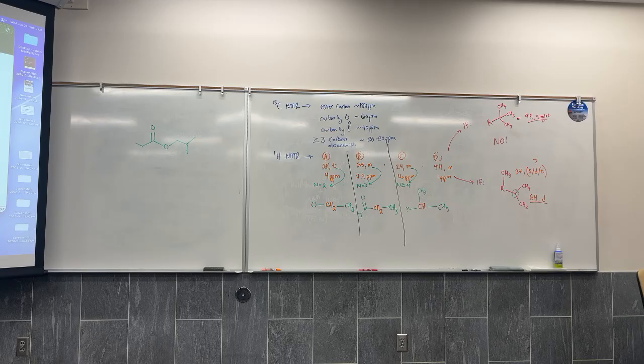If I'm wrong about the integrations, if I made a mistake there, I don't necessarily want to put in the number of hydrogens because I'm not sure that that number is actually correct. So I'm refining this with some number of carbons and this proton signal. It should limit a lot of those hits. I now only have 134.